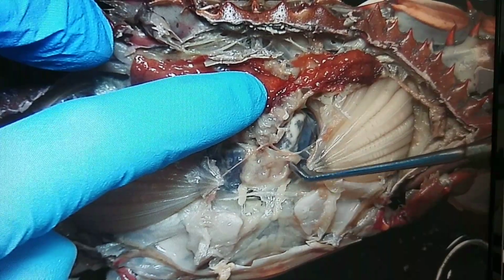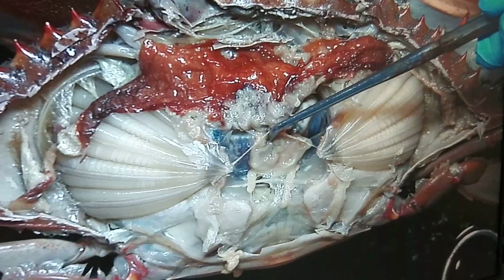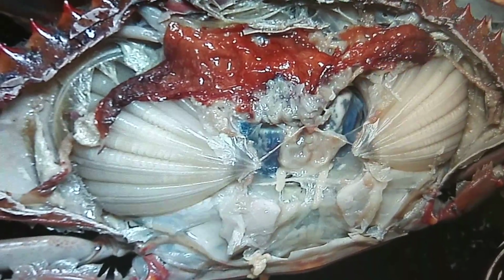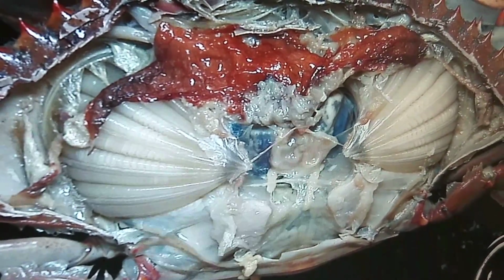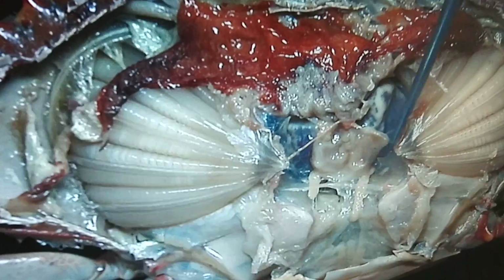But when you look up close, you can actually still see the ostia. Wait, is the heart still there or no? The heart's there. Where? Oh, is the heart the beige thing, not the red thing? Right, that's the heart.